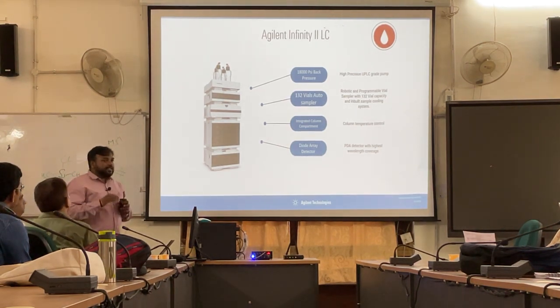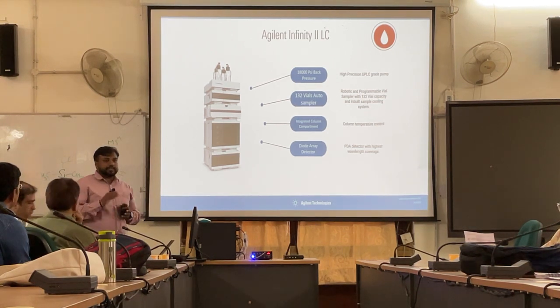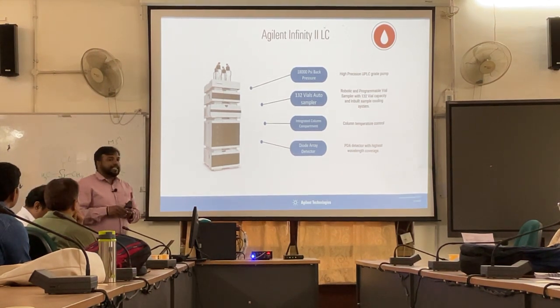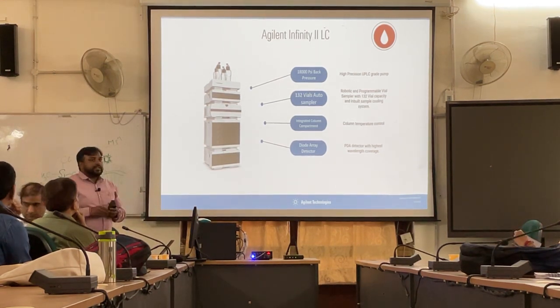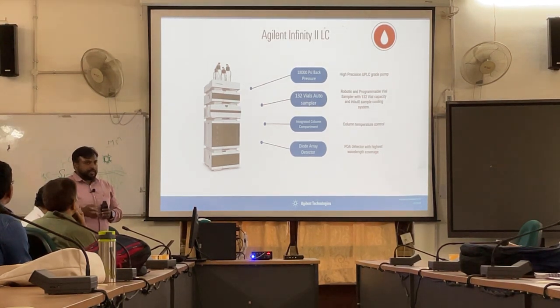As you know, this instrument is tandem with the QTOF. So LC here we are using just for the separation technique. Along with the LC, we can also use the LC detector. Like we know that with LC we can use UV, IR, FLD, ELSD. But mostly we are using UV once we are using the configuration with the LC with MS.